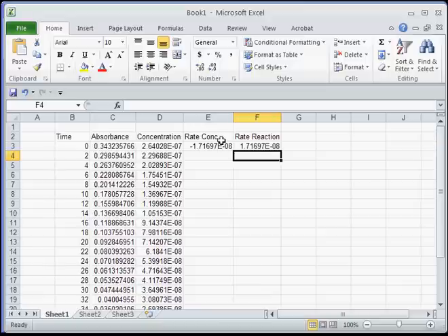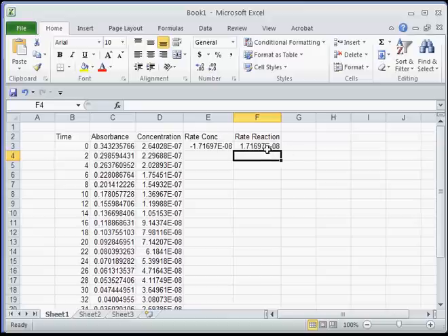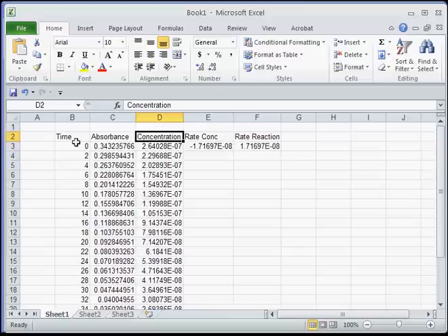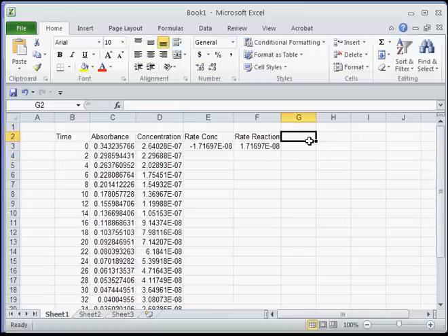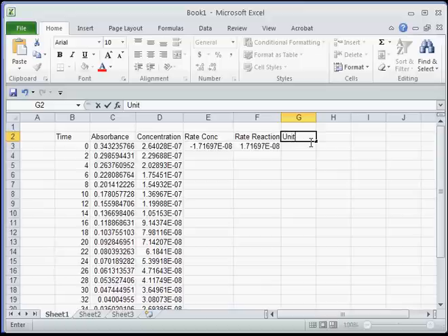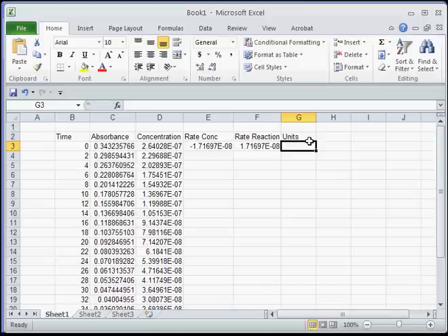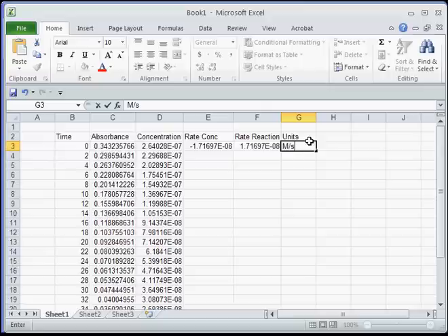As far as significant figures goes, absorbance, I think, is probably giving us about three significant figures. So in this number, you have about three significant figures. So for my first experiment, remember this concentration change is in molarity and the time is in seconds. The units, which I'll just type over here, but it doesn't really mean anything to Excel, the units are in molarity units per second, because the rise is in molarity and the run is in seconds. So I hope that helps you guys.